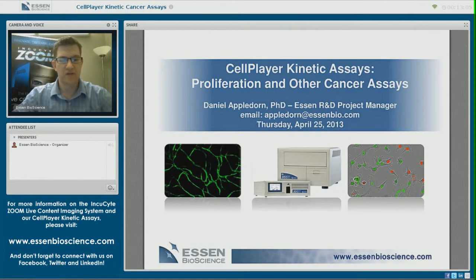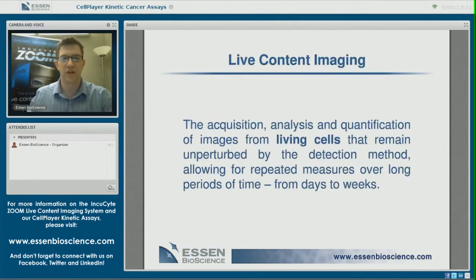Before launching into a detailed discussion of how we use live content imaging to measure proliferation in a kinetic way, I want to first take a step back and talk, at least conceptually, about the idea of live content imaging and provide you more of a definition.